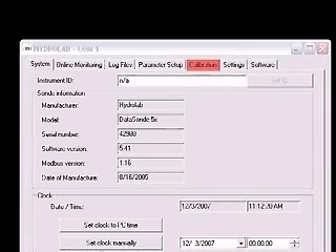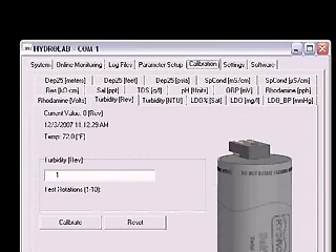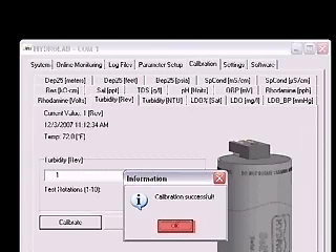Again, in Hydrus 3LT, click on the Calibration tab, then click on the Turbidity Rev tab. Verify that the value in the box is 1 and click the Calibrate button. The wiper should make one complete revolution, removing any air bubbles from the optics. Click the OK button in the Calibration Successful window.